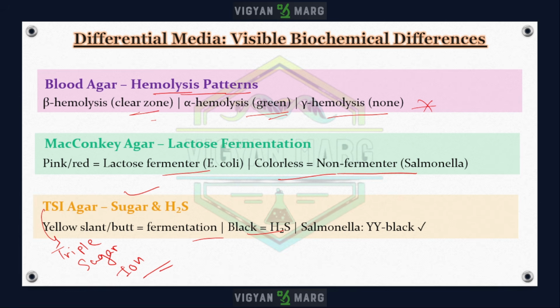Differential media give you an immediate visual clue to biochemical behavior even before you run detailed biochemical tests. This is the advantage of differential media.